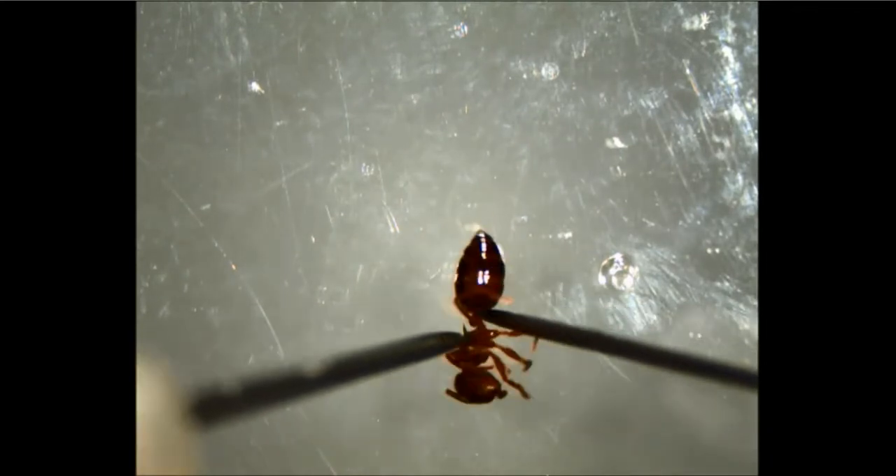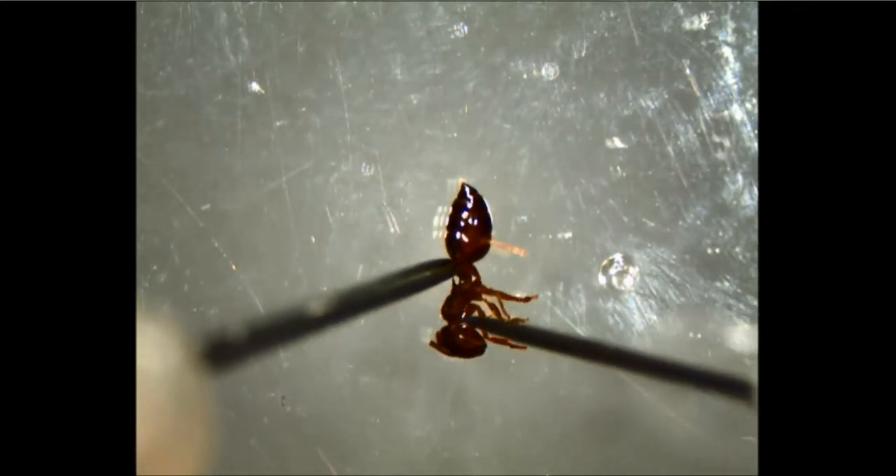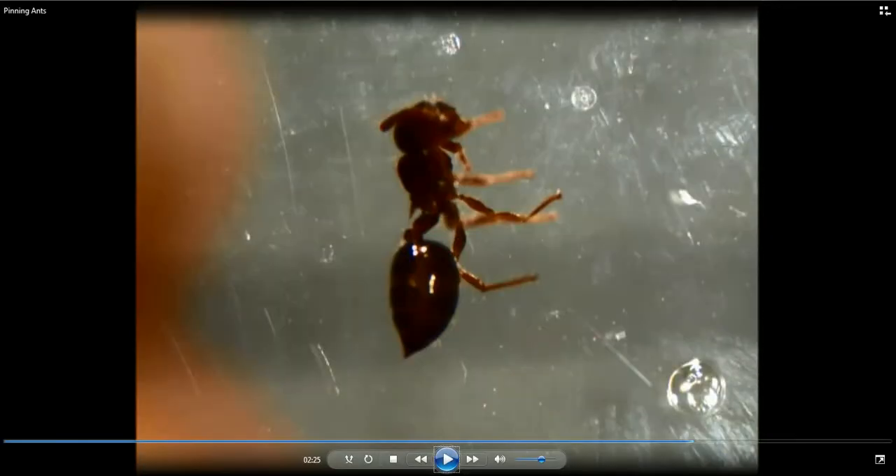Very small one. We're going to straighten those legs out. Again, we're going to position the ant with the head up and legs to the right. In this case, the ant is so small it's really hard to get the legs exactly where we want them. But with the legs in this position, I'm able to push the point right down in this area right in here, so it'll go in the right place.